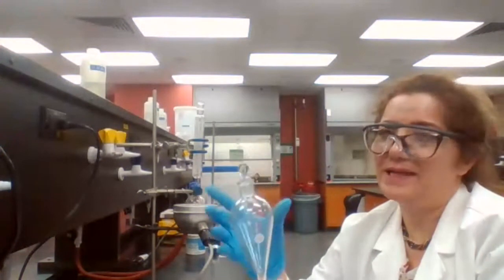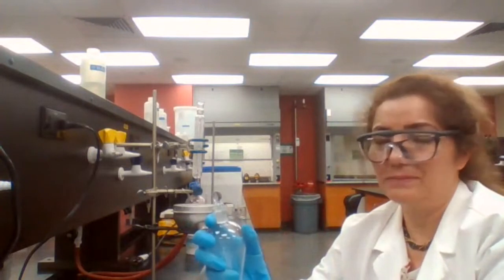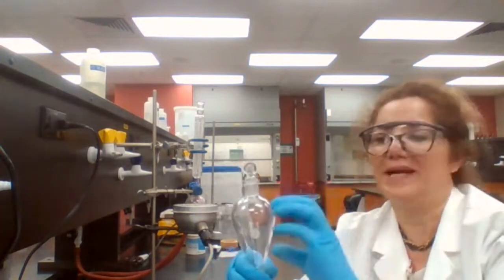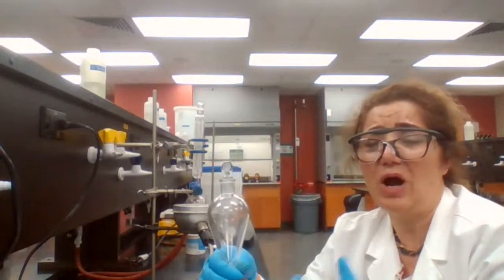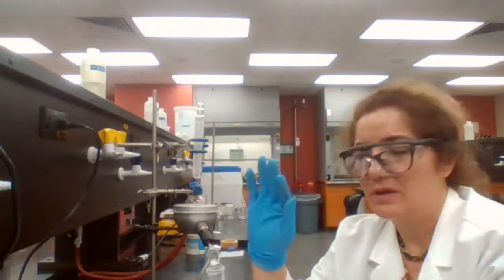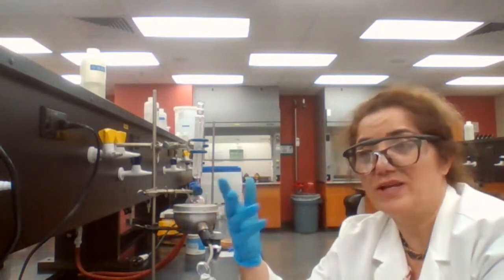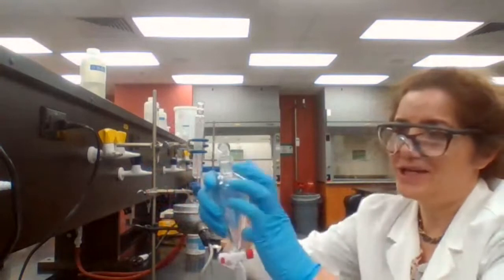So the factor that is used is known as a partition coefficient, and the symbol for that is the KD. Partition coefficient is the ratio of the solubility of your sample in the organic layer versus the aqueous layer. Your sample is going to be highly soluble in one layer and very low solubility in another layer, and you have to do multiple extractions. The design of the coffee maker is based on extraction, because you think that you are brewing coffee, but you're actually doing extraction.